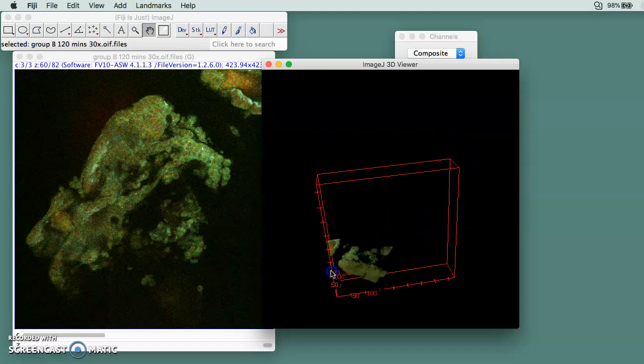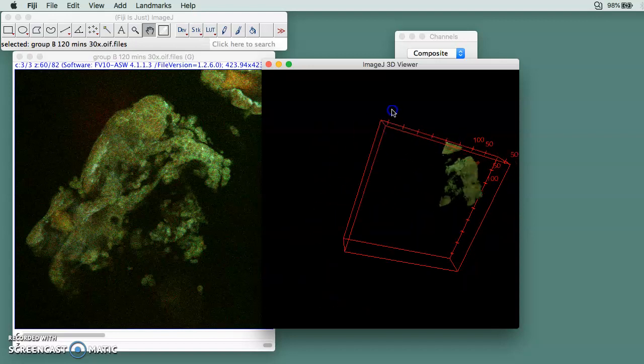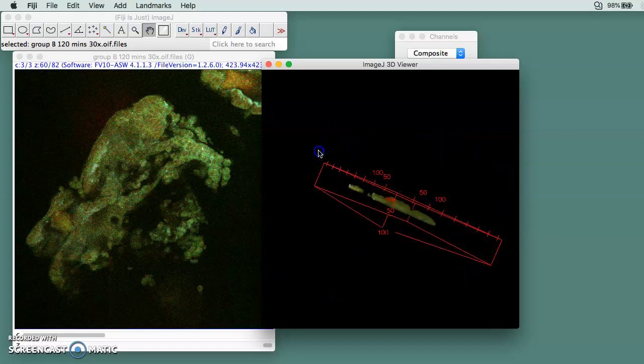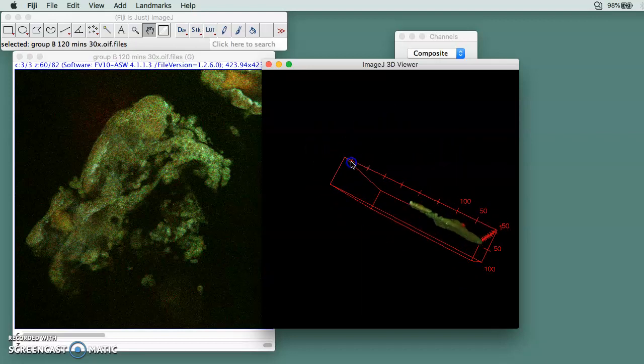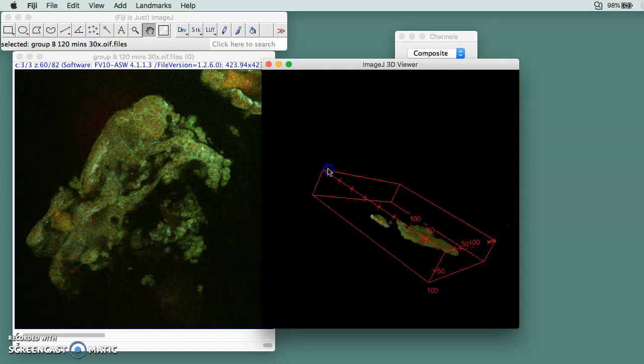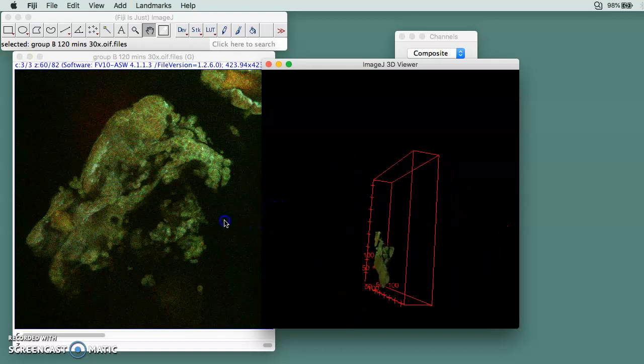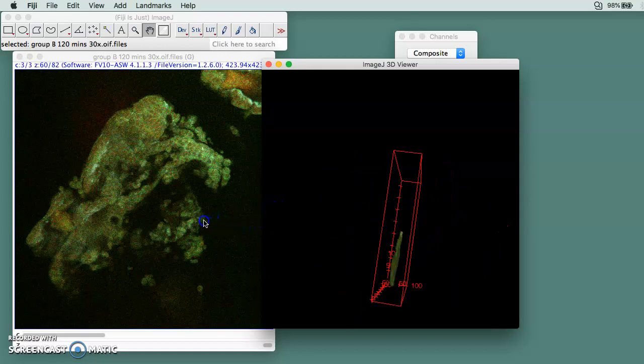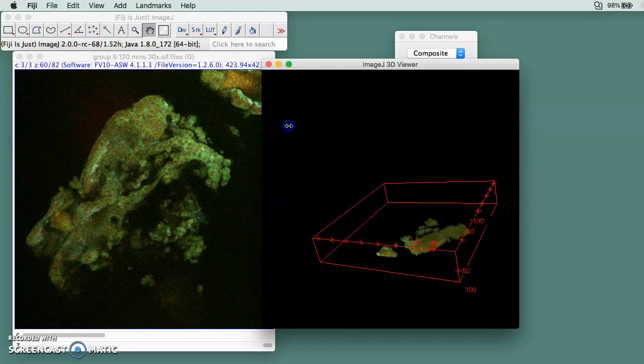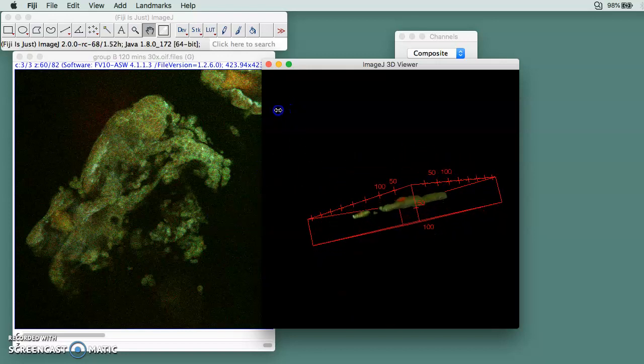You will be able to get this 3D image. My sample is pretty flat, but anyway, that's how you do it and how you use the 3D viewer plugin.